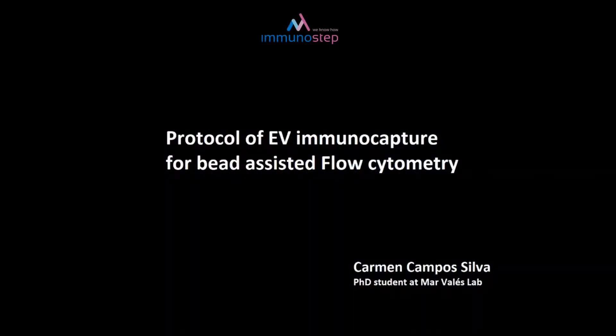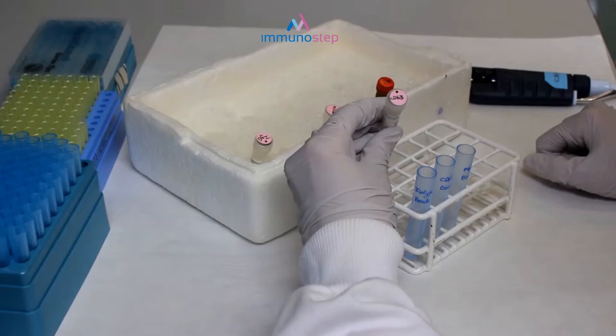Hi, here you will see how easy is the protocol of EVI monocapture for bead-assisted flow cytometry.